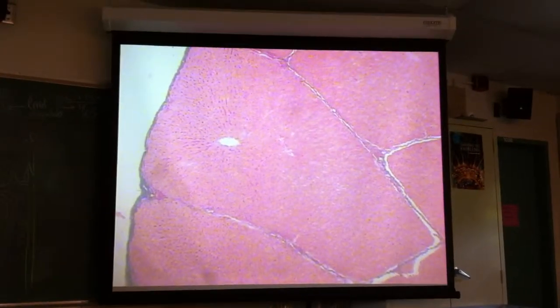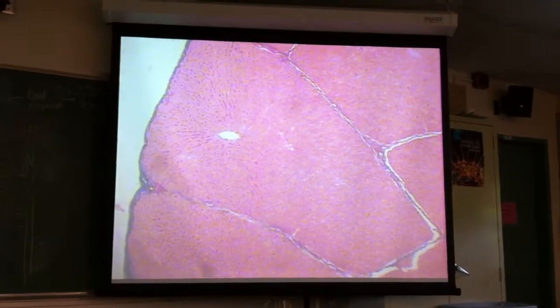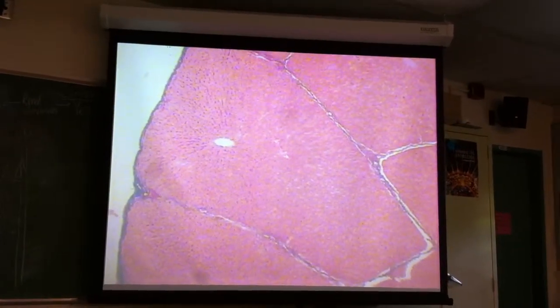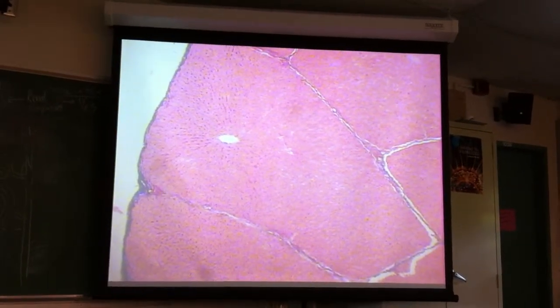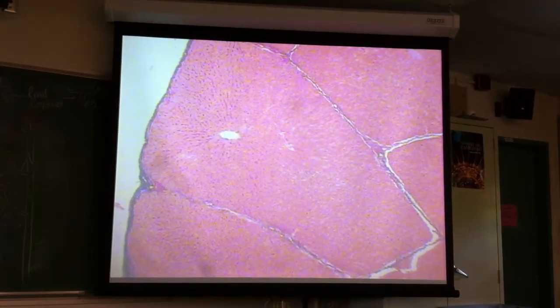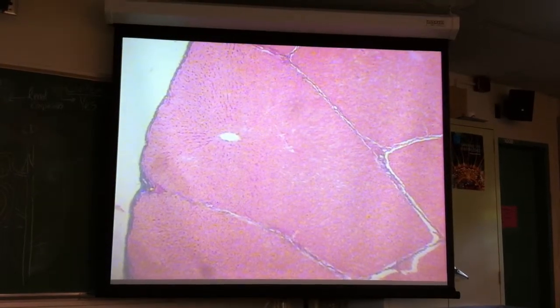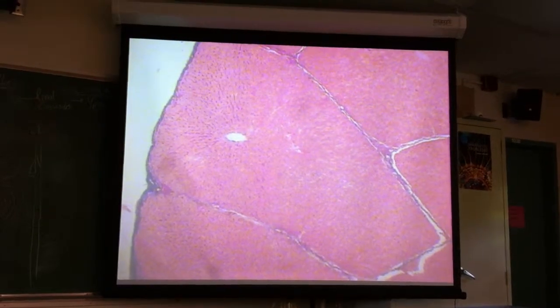Now if you have one of the pale slides, it can be really difficult to locate those connective tissues that are separating lobules. However, the central veins usually are nice and open like that. You can see a central vein, know that you're going to have to move away from it, and that you should hit a connective tissue not too far away. Once you find that connective tissue, track it until it forms a junction or a union with the connective tissue of other lobules. Now, let's zoom in on this one and see what we can see. It's pretty small, but maybe we'll get lucky.